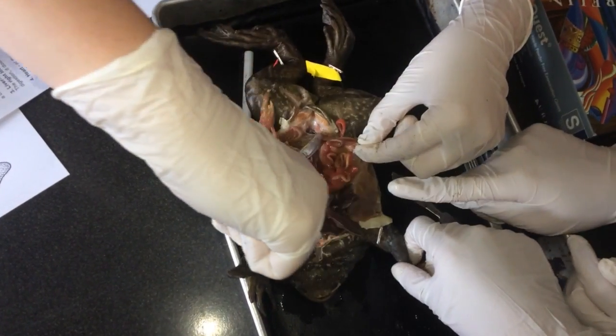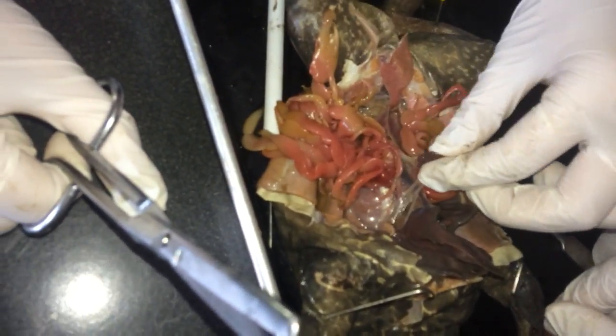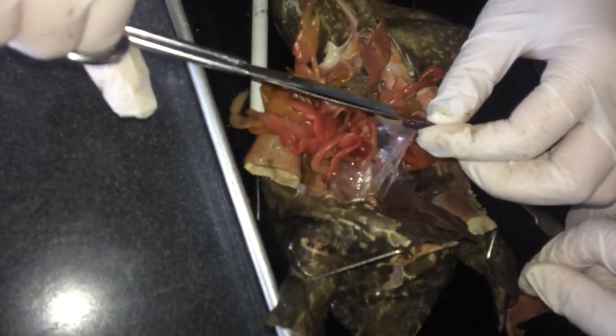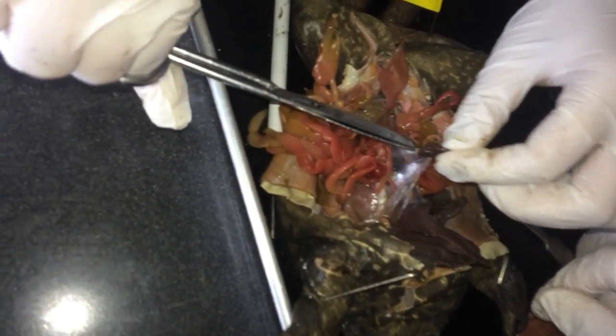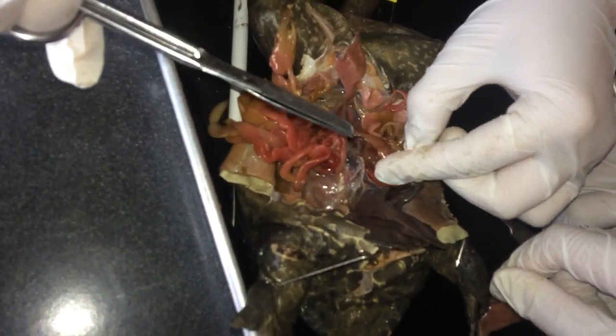What is that bean shape? That, I believe, is the spleen. Okay. Should we cut it open and see what happens? Sure. Blood. Blood. Blood. That's what the spleen does — keeps blood? Yeah, that's definitely just blood in there. Good.